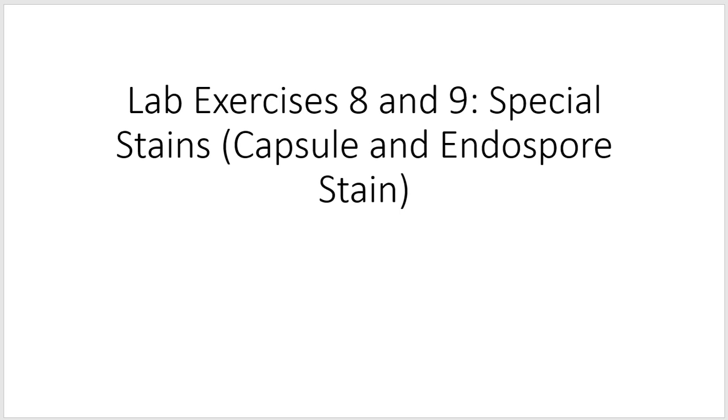Because of the technical challenge of these two, as well as some risk, we don't actually perform these stains in microbiology, but we do want you to know about them and be able to look at some stained images that are already performed and understand what you're looking at. So that's the goal today, and there are some questions in some places in your lab manual where you can draw these examples out, so I encourage you to do that.